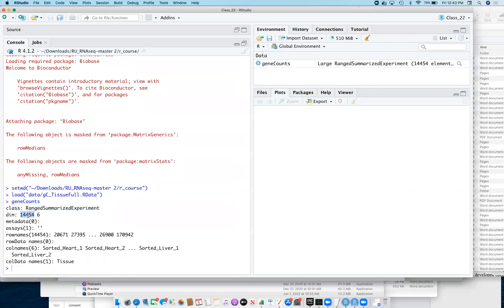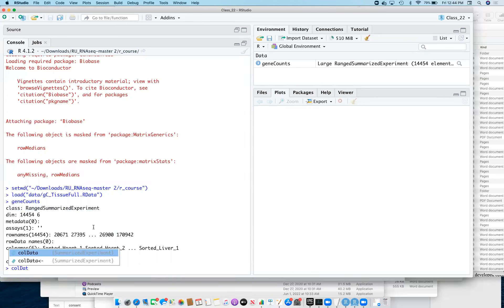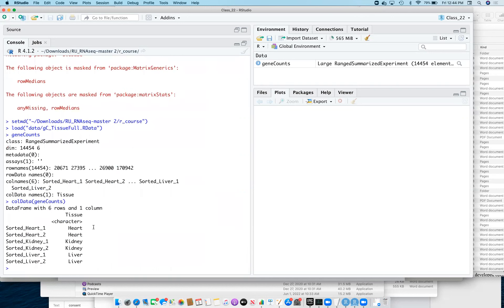This is mouse. I have 14,000 genes for this particular RangedSummarizedExperiment object, six samples, and we can see the column names here — heart, heart two, liver, liver two, and there's some in the middle. I have already attached column data — metadata — to this, and that is by tissue. We also have row names, which will be Entrez gene IDs. If we want to look at the colData, we should be able to just do this — look at the metadata associated to these samples — and you can see we have two of every sample group: heart one, heart two in the tissue heart group, kidney, kidney in the kidney group, liver one, liver two in the liver group.